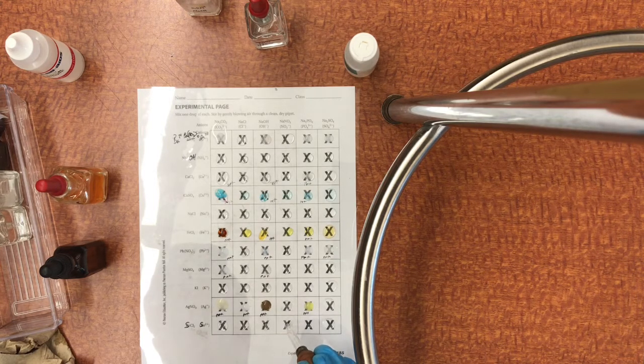No reaction. Well, there goes so much for being interesting, eh? Other than those little bit of bubbles at the beginning, I'm not really seeing anything exciting here. And those bubbles, I think, are just from the dropper.